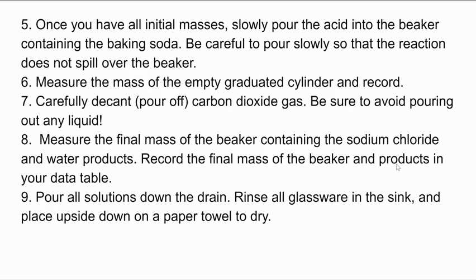Carefully decant, pour off, the carbon dioxide gas. What that means is that we don't want to lose any of our solution, but carbon dioxide is heavier than air and it kind of fills that beaker. So we need to tip the beaker so no solution comes out, but the heavier gas will spill away. And then measure the final mass of the beaker containing the sodium chloride and your water products. Record the mass of the beaker and products in your data table. And then you can pour solutions down the drain, rinse your glassware, and place it in the sink. Place everything upside down on a paper towel to dry for the next period.